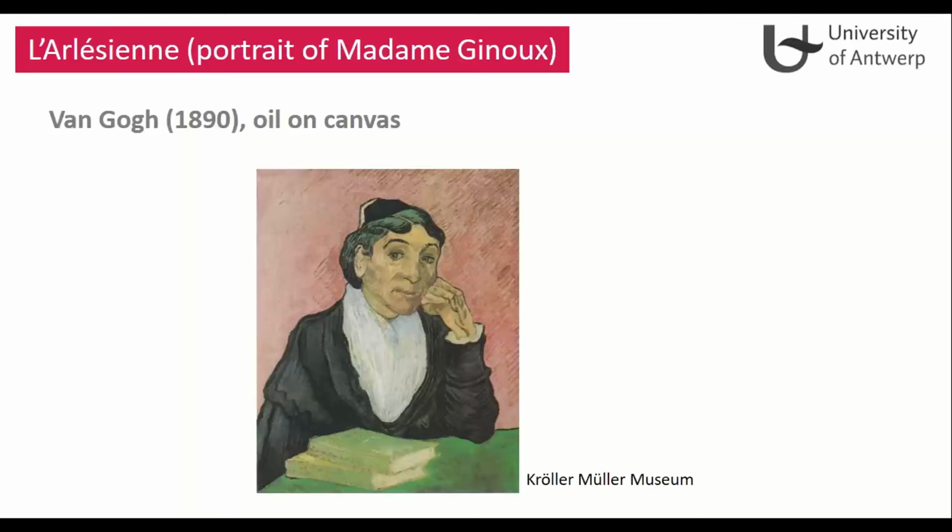We could see that this pink background has faded compared to the original when it was first painted. We know that because the areas covered by the frame show a brighter pink tone than the areas exposed to the light. So it was very interesting to understand which pigment was used to produce this pink color, because then it would be possible to think about the most suitable strategies for preservation of the painting and to mitigate or avoid, if possible, the degradation of this background.